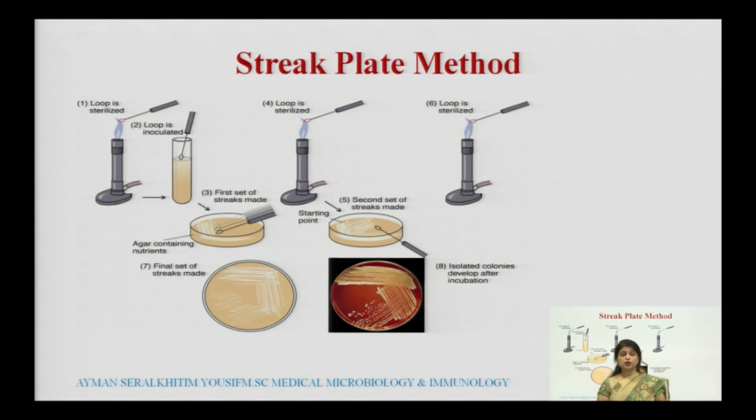First of all, I would like to focus on the streak plate method. Now, what is the streak plate method? As I told before, in each and every isolation process you first need to make the media. Until and unless you have the nutrient media, you will not be able to isolate any species, and the media must be solid in nature. If you go through my lecture number 4, I have covered how we can prepare nutrient agar medium, how we can prepare solid media in the lab. So the first and foremost requirement is to prepare sterile nutrient agar medium, which must be solid in nature.